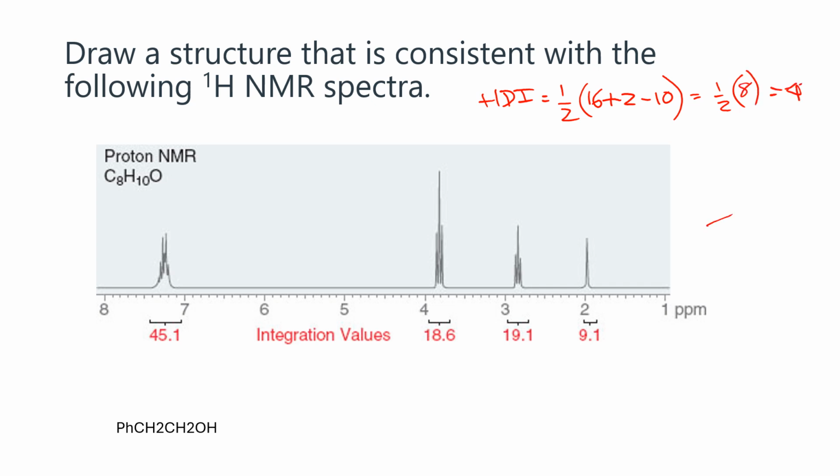So I already know that I'm putting fragments together. I will have something like that. And this is complex, so I'm not expecting a para substituent or anything like that. But I have here my ethyl pattern. Actually, if you see this here, that's 3.